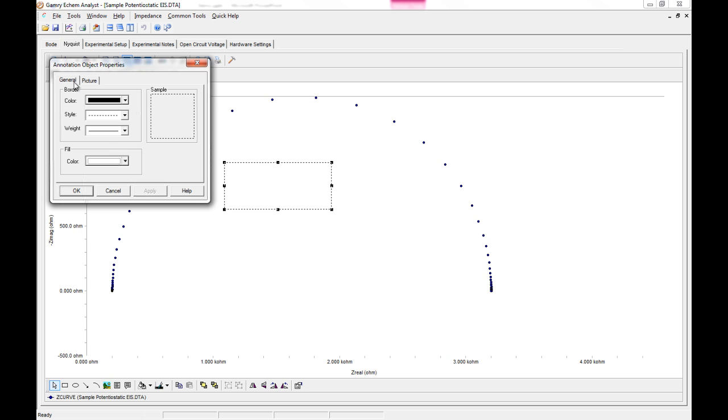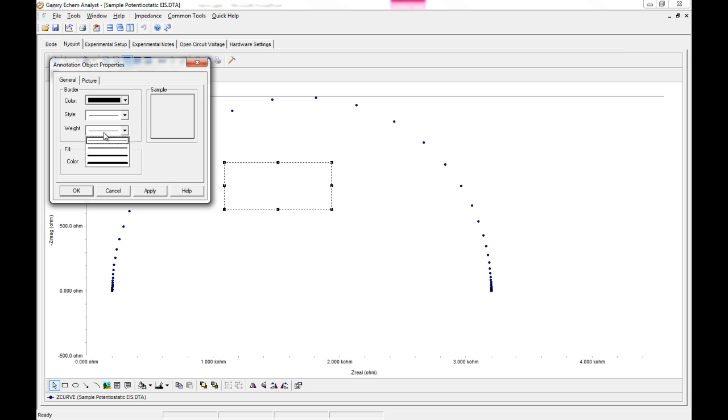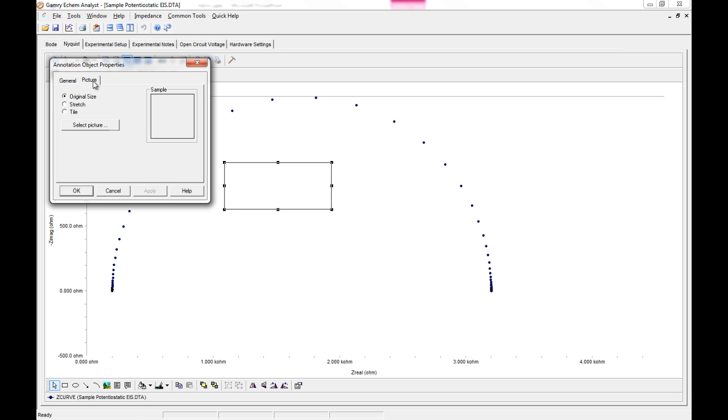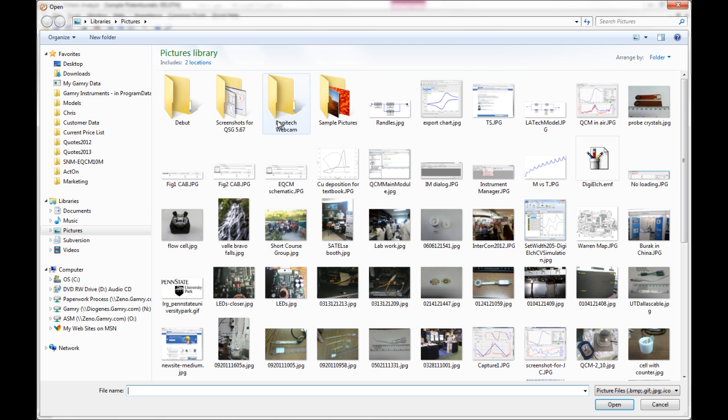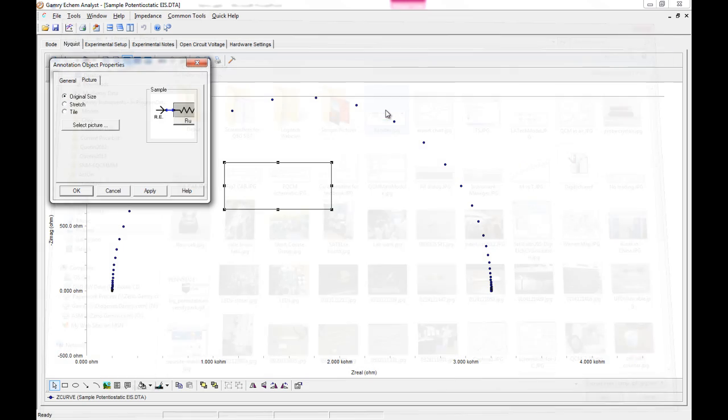And now there's two tabs that show up. You can define what you want your border to look like, if you want to add a border at all. You can also click on the picture tab. And then you can select your picture.